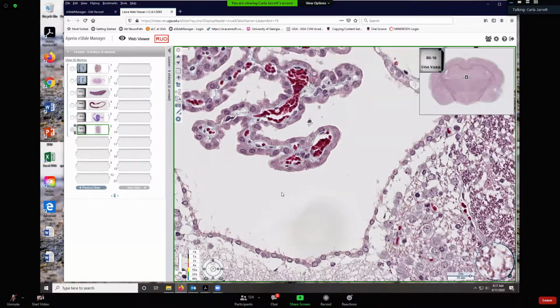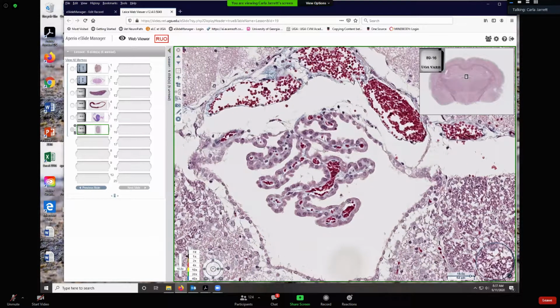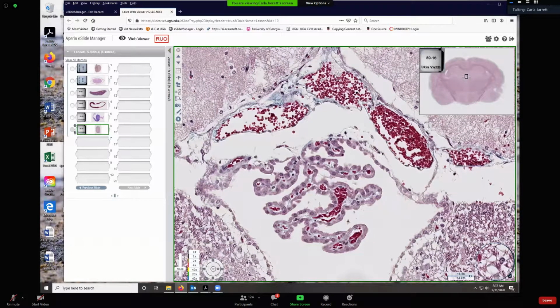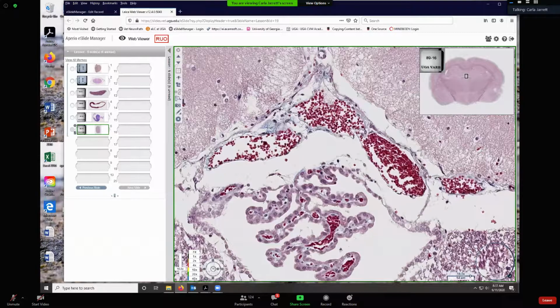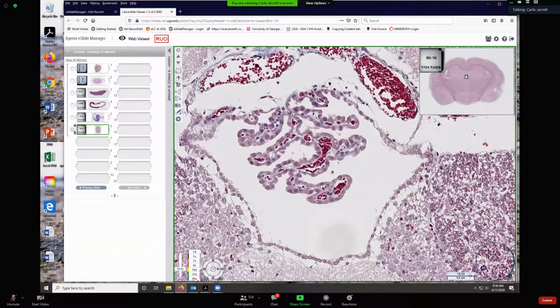Now, these ependymal cells line the ventricles, and in certain places along these ventricles, they'll fuse with the pia mater. Remember, I said the pia mater is highly vascular. So here we are. This is the pia mater. You can see that connective tissue right against the nervous tissue here. And here are the big distended blood vessels associated with that pia mater. These ependymal cells will fuse to some of these blood vessels right here, and these blood vessels will become modified.